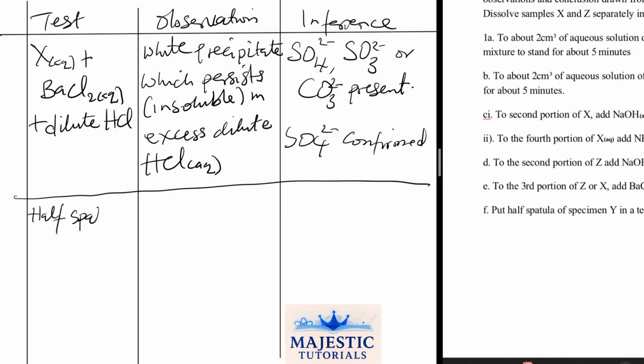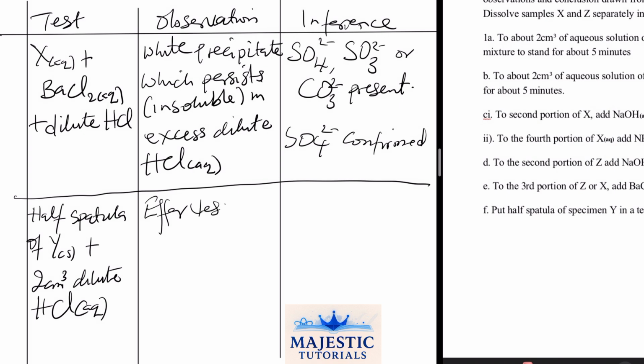Half spatula of Y solid plus 2 cm cube dilute HCl aqueous. What will happen? Effervescence will occur. Effervescence occurred. Colorless, odorless gas.